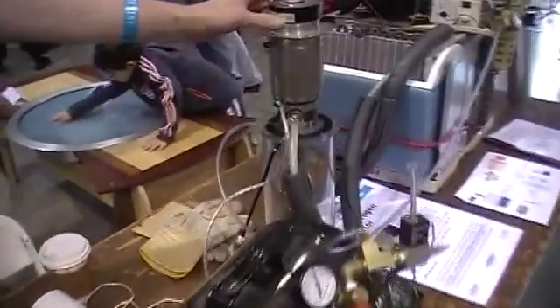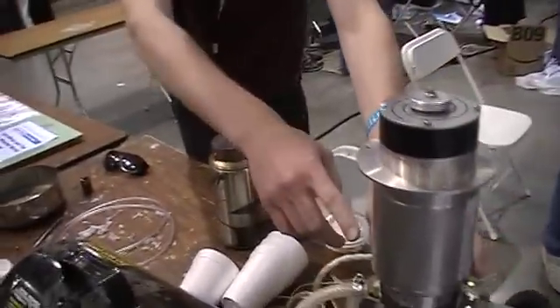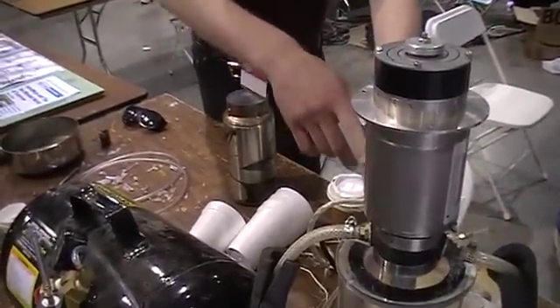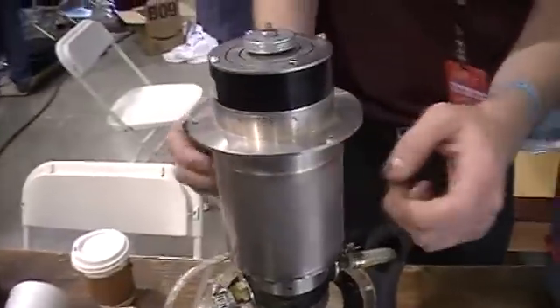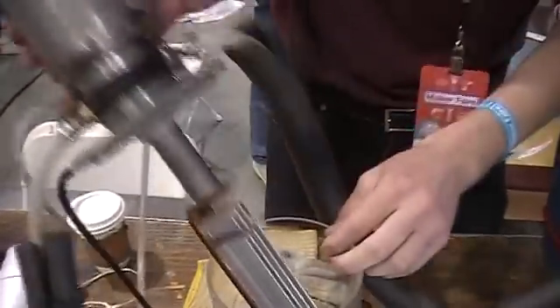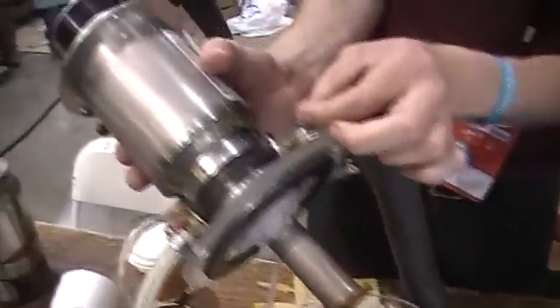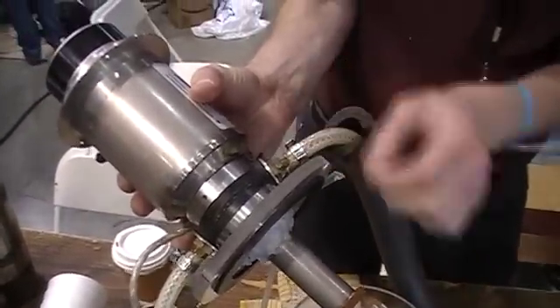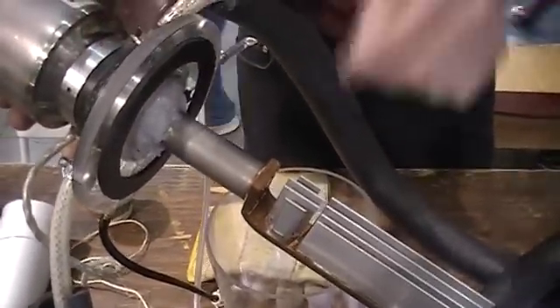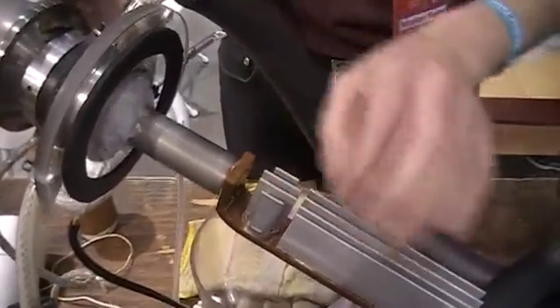All we have here is a Sterling Cycle cryo cooler. This device uses helium — the tank is filled with helium. The helium is expanded at the tip of the device and compressed up here, and the cycle continues: expansion, compression, expansion, compression. The tip gets cold and this part gets hot. The tip gets so cold that eventually liquid nitrogen is formed here.